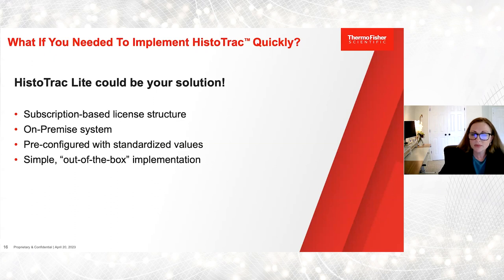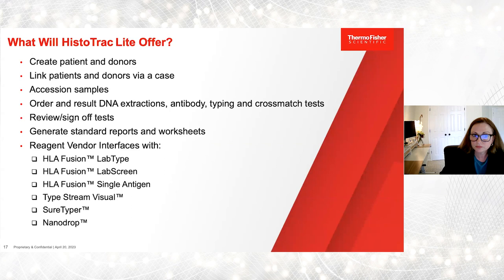So in development right now, we are working on HistoTrac Lite, and this could be what your solution is needing. It would be a subscription-based model. It would be on-premise, so you would host it, but it's going to come pre-configured with standardized values. So there wouldn't be any of the customization that would need to happen, because that's sort of already been done for you. It would make a simple, more out-of-the-box implementation for you.